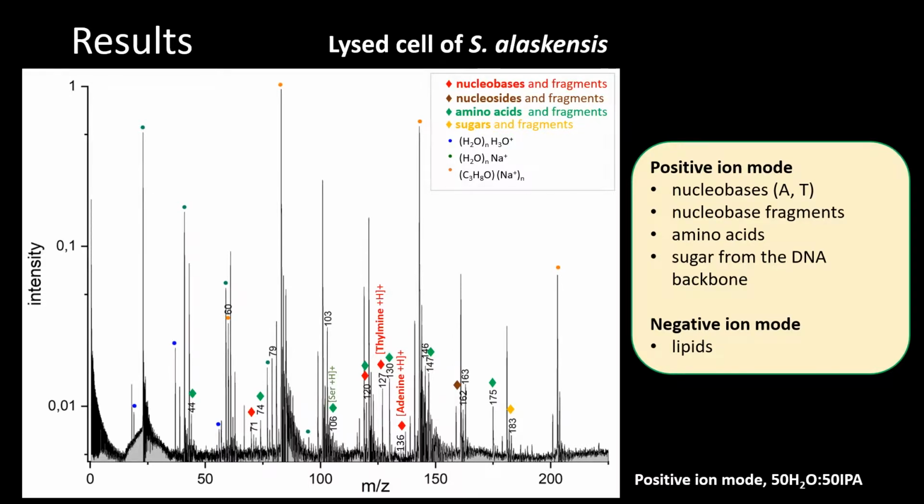In the negative mode, we also identified many lipids. I didn't show the spectra here because of lack of time, but if you are interested, I could, of course, provide more spectra.